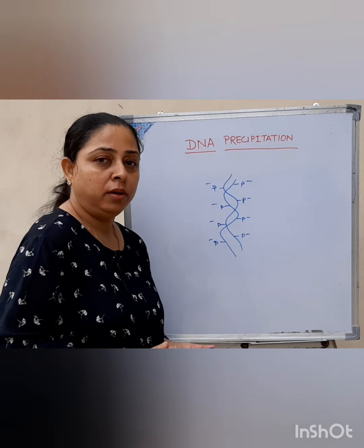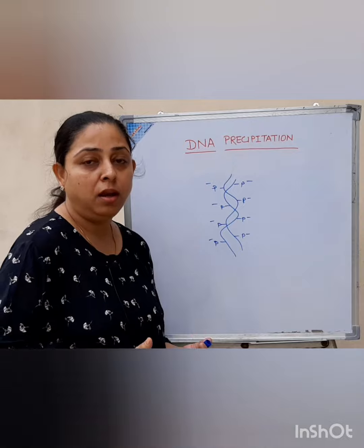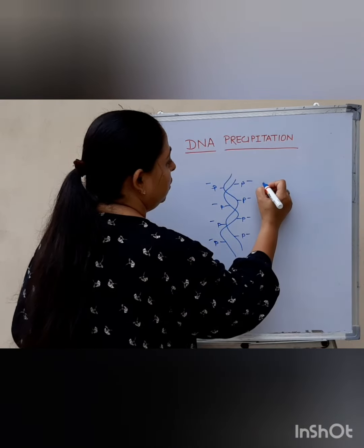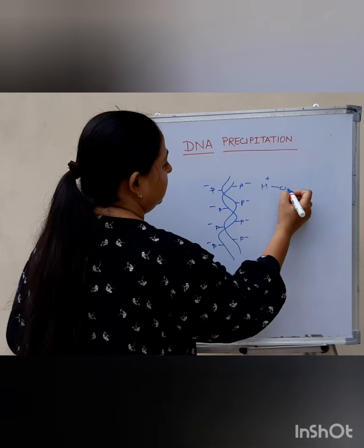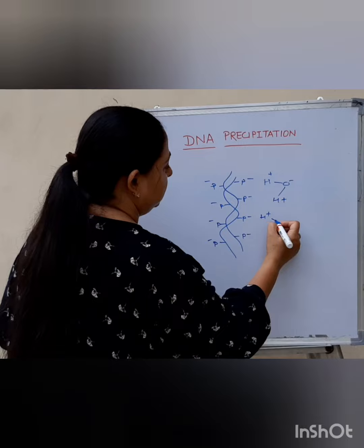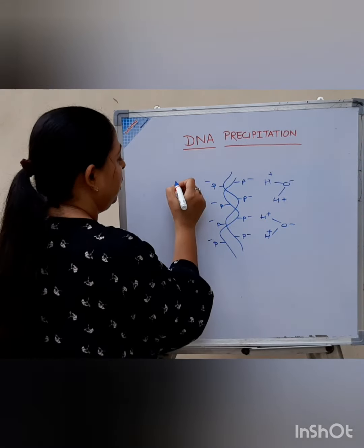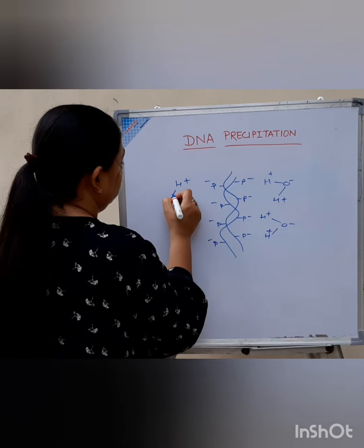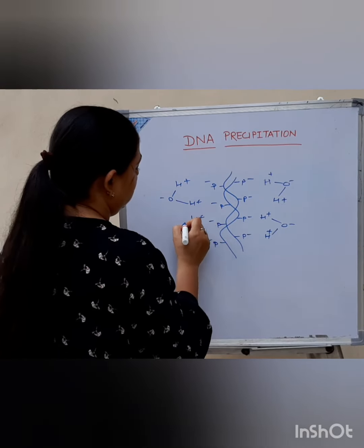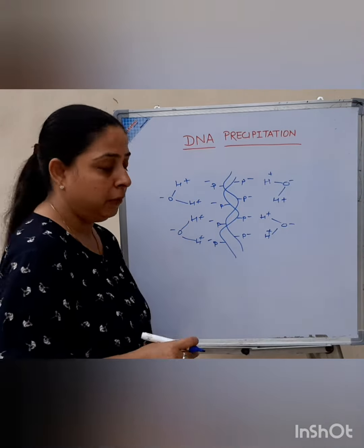DNA remains soluble in water by formation of a hydration shell. Water forms a hydration shell around the DNA molecule. So it is just like this. A hydration shell is formed around the DNA molecule, and this keeps the DNA molecule dissolved in the water.